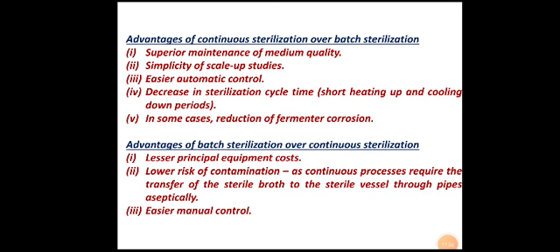Next, easier manual control in case of batch sterilization. These are the advantages and disadvantages that you need to remember in relation to continuous sterilization and batch sterilization.